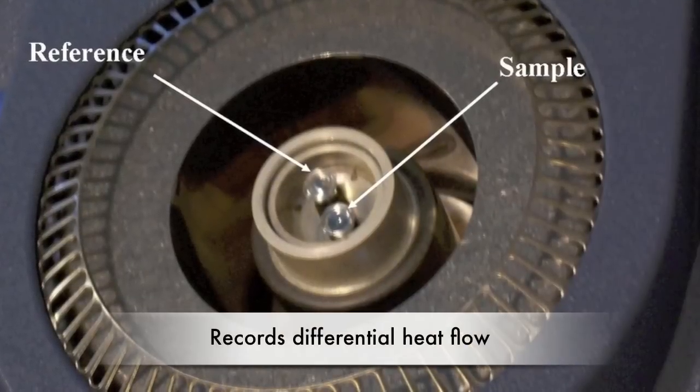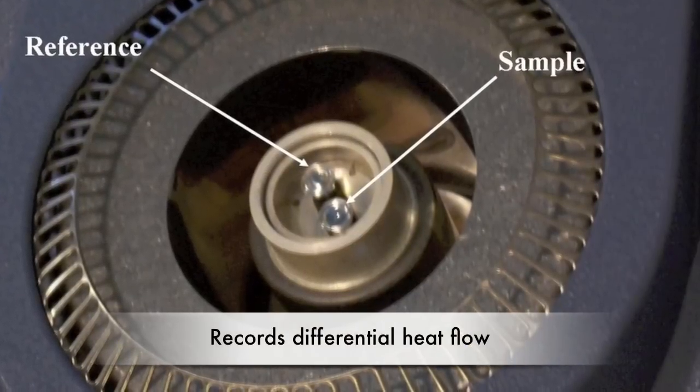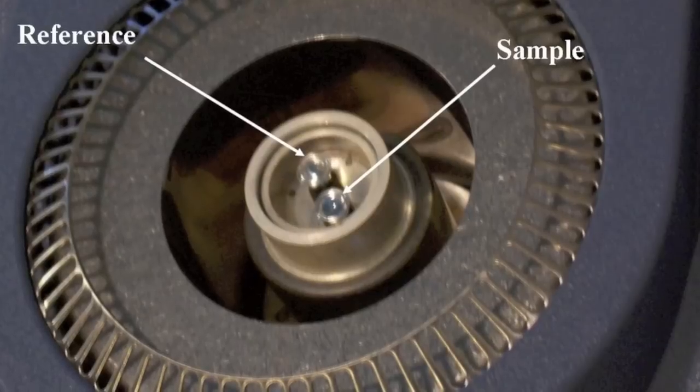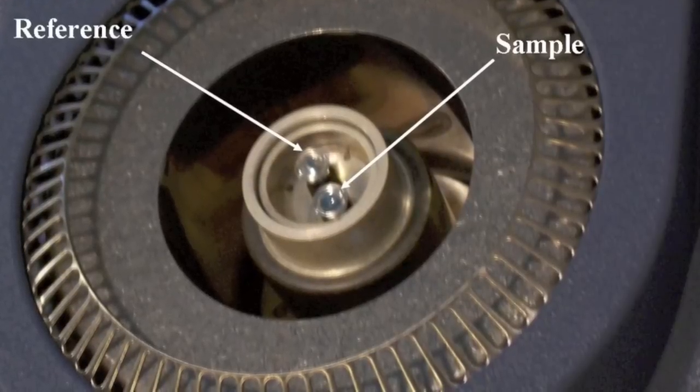The Q20 heat flux DSC works by trying to maintain the reference and sample pans at a constant temperature. But since the sample has a heat capacity, a differential heat flow is needed and recorded.